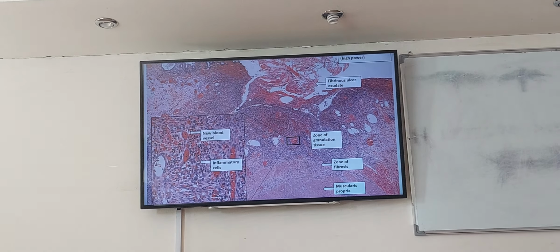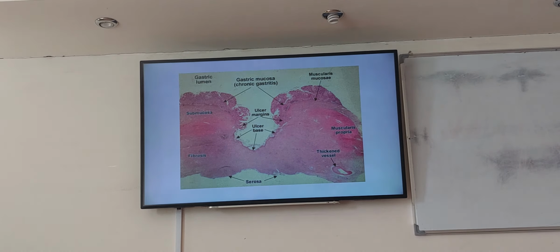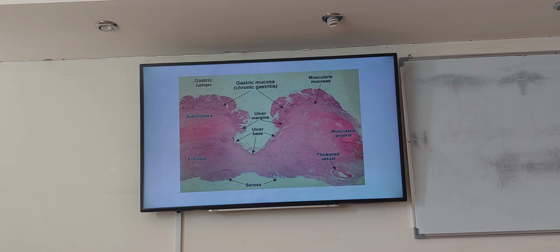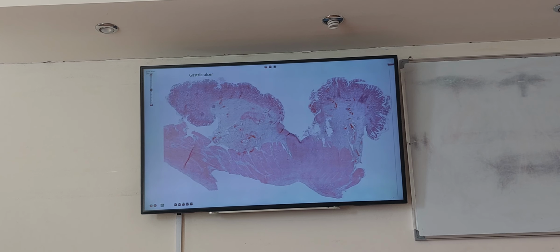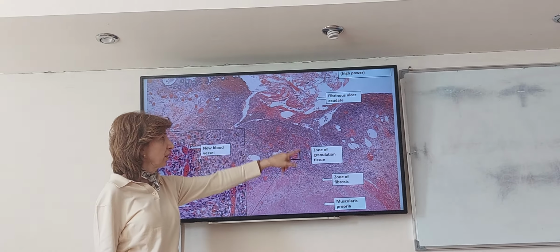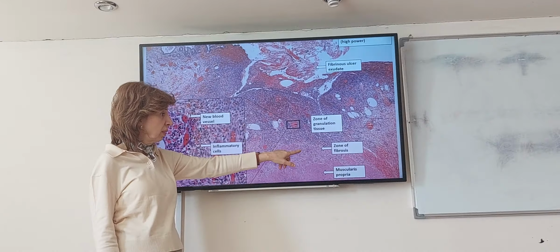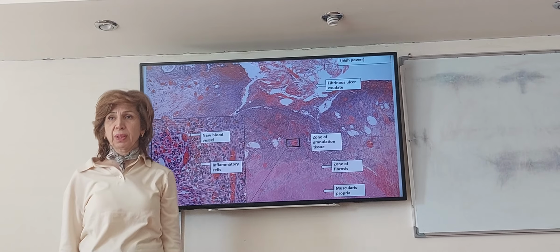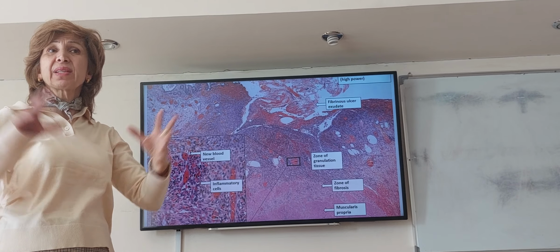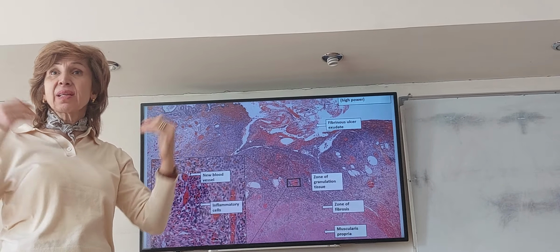Okay. Any questions? So I will put the picture, gross, how it will be in the test or exam. And then I will tell you what this is. You already told me the ulcer. Now tell me the layers. You start. Necrotic with neutrophils, fibrinous exudate also I can tell. Zone of granulation tissue, zone of fibrosis and muscularis propria. This can be fibrinous with necrosis, with neutrophils, everything admixed in the upper part. That's the remnants of the acute inflammation.